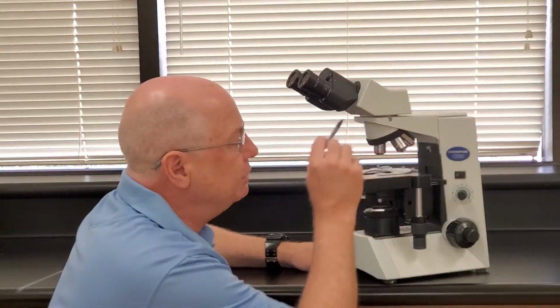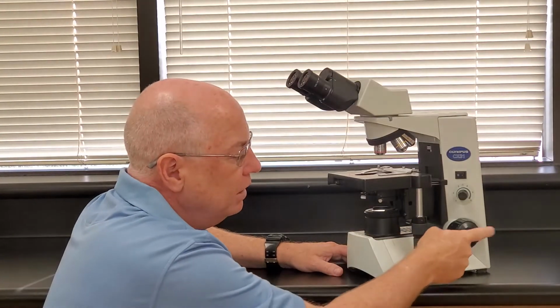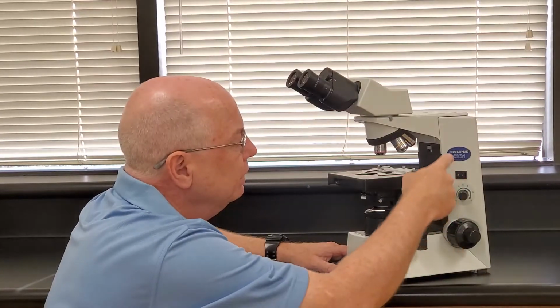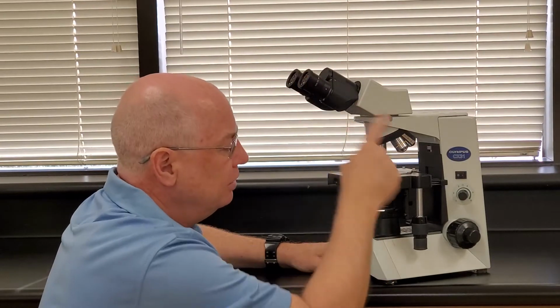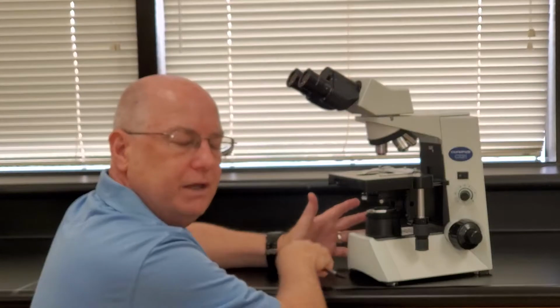So you will see pictures of the microscope with pointers saying, please identify the round rubber wheel, please identify the small wheel, please identify the structure, please identify this microscope part, please identify that microscope part, and you should know all the parts.